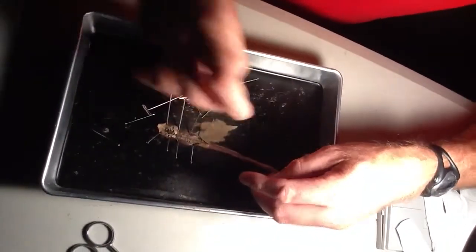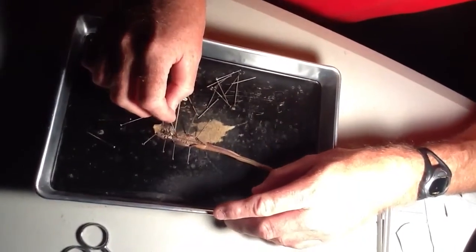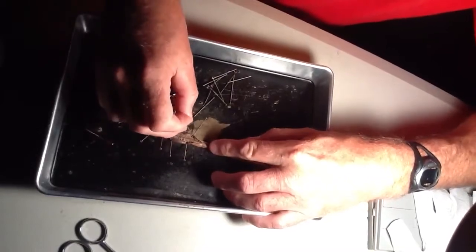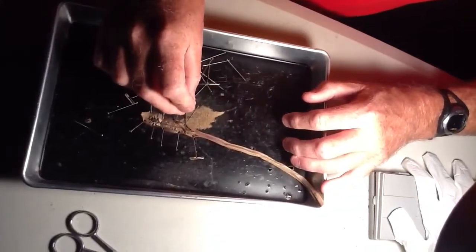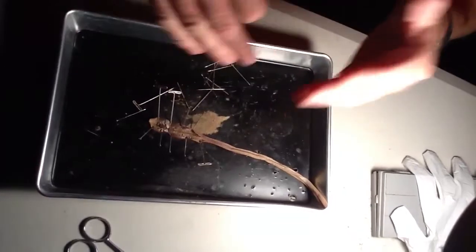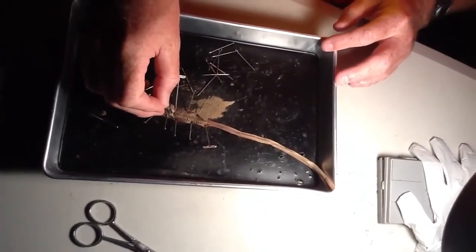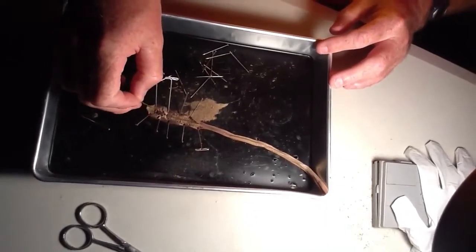The way I really tell if I did a good job is this black line, which is the dorsal blood vessel, should be right on top, which is pretty much what I did. And you can see the septa right there, which I don't think I'm going to scrape because I'm going to leave that one full. And so what I have is the septa, and that's what I've been scraping, those little teeny dividing things. As I scrape them and tear them, that allows the skin to open up. And then like this area needs to be scraped a little better. And when you're all done, it lays flat like that.